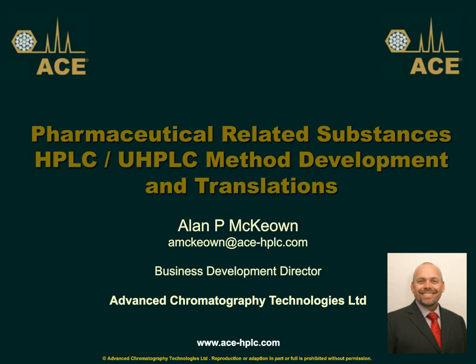Excellent. Does USP allow one to do method translation to other particle sizes for gradient separation, or is complete validation work needed? Okay, so my understanding is that the allowable gradient changes are very, very small. I do not think that you can do what the question is asking.